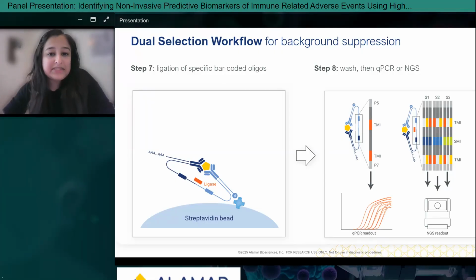In the case of the multiplex assay, there's the addition of a sample-specific barcode during the proximity ligation reaction that enables the generation of a single library from all 96 samples in a plate, which can then be sequenced with a standard sequencing workflow.